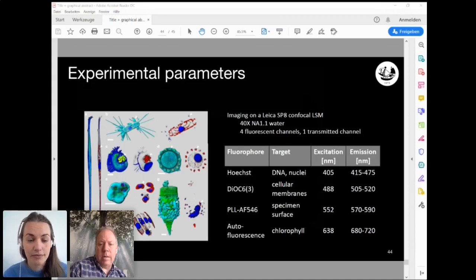Are you trying to actually do the microscopy on the vessels at the moment, or is it still all done on land? That would be the dream. But of course, on the research vessels it's going like this the whole time. There will be vibrations. It's an interesting problem, it's tricky. You need very good autofocus. At the moment, the samples are fixed directly after sampling on the research vessels, and then we image them on land. Okay.